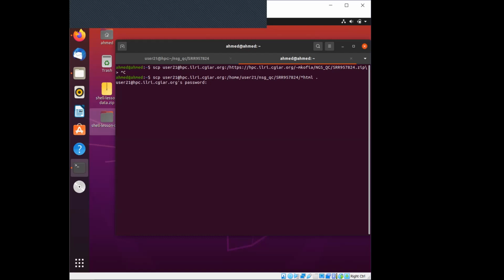Okay. Bio 21. Then info. What's that? Permission denied.